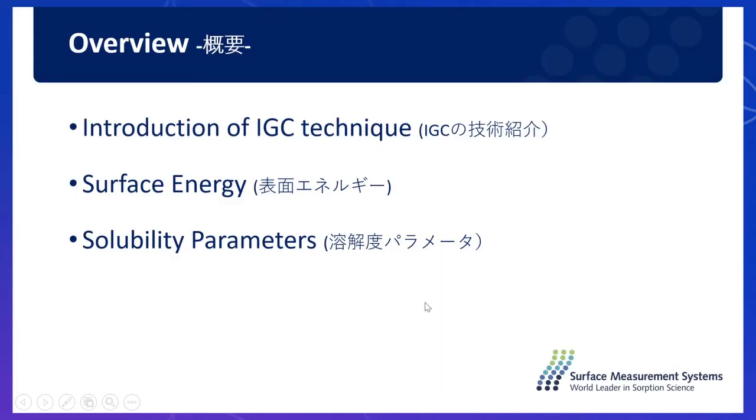The structure of my presentation is on this slide. First I will introduce the iGC technique, and then I will show you some applications on surface energy analysis, and then about solubility parameters measurement.